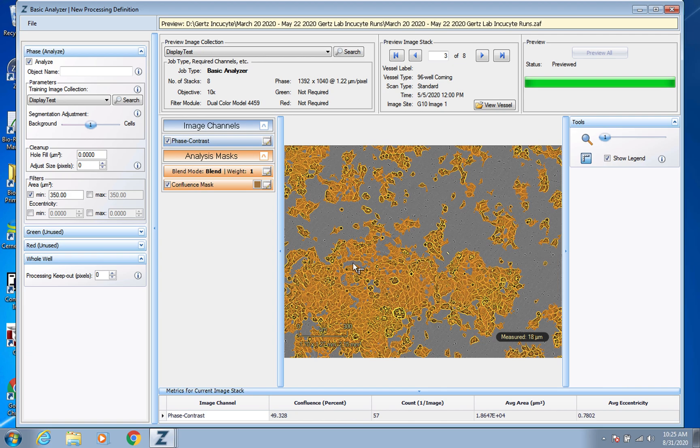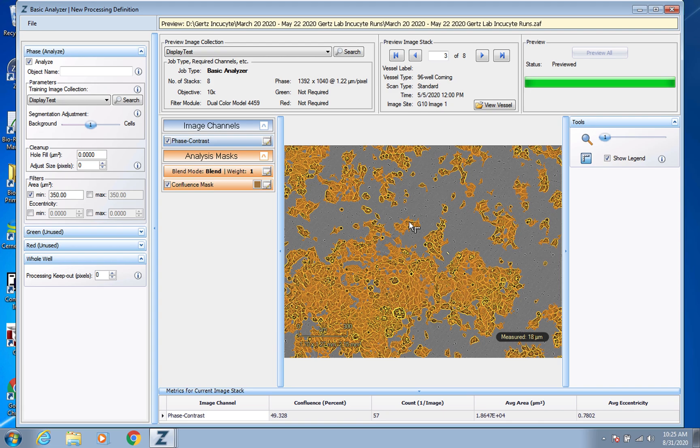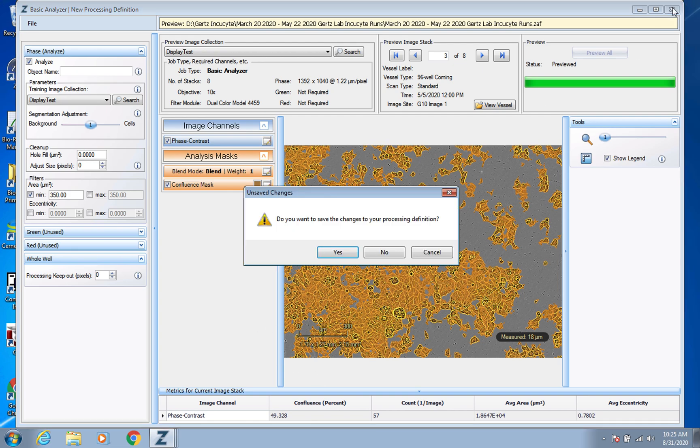So this is, I showed you this on a proliferation plate. But honestly, it's the same process for a wound scratch plate. Because if you think about what a wound scratch plate is doing, it's just initially detecting the scratches. But then it's, which it's very, very good at. And then it's just detecting the confluency of the cells within that. So while it has different processing definitions for them. And so you would have to create one for that cell line. It would be the exact same process that we just went through for this.